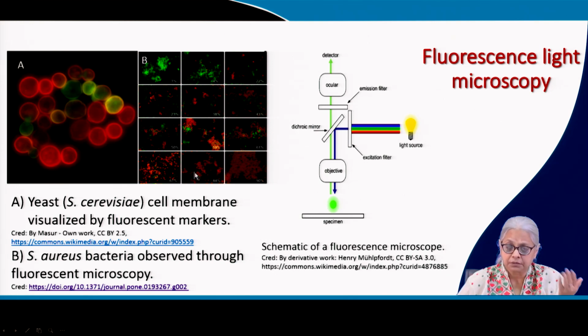The color that is caught, in this case, is red. In the case of the living cells or intact cell membranes, the color is green, and that is because of different dyes reacting in a different manner. So this kind of difference in the reaction of different cells to these dyes can be used to separate living cells from dead cells.